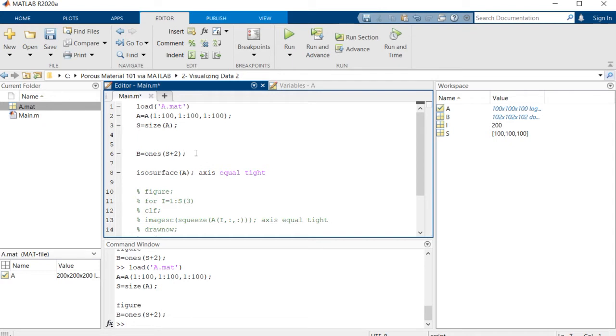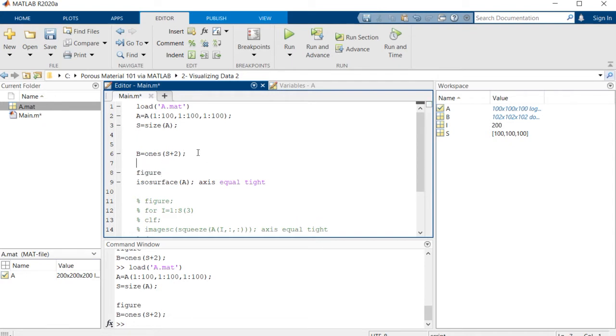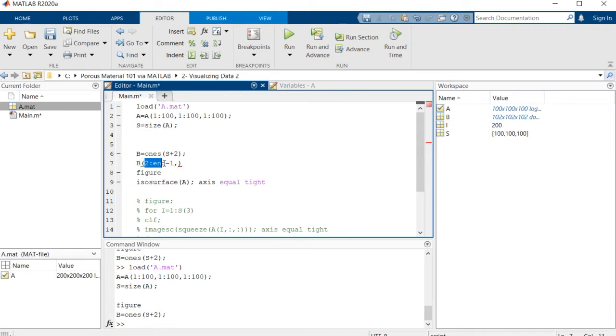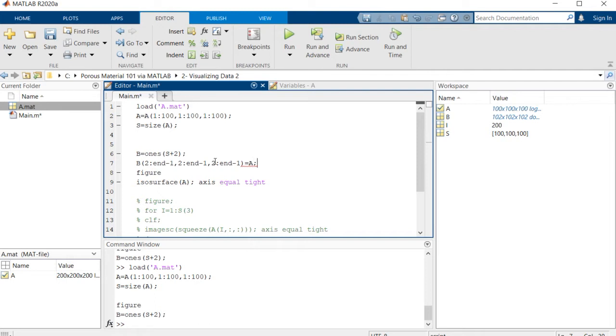So let's do this. And this is b. Then we want this b to be, we want to be elements from 2 to n minus 1 and the same for other directions to be equal to a.